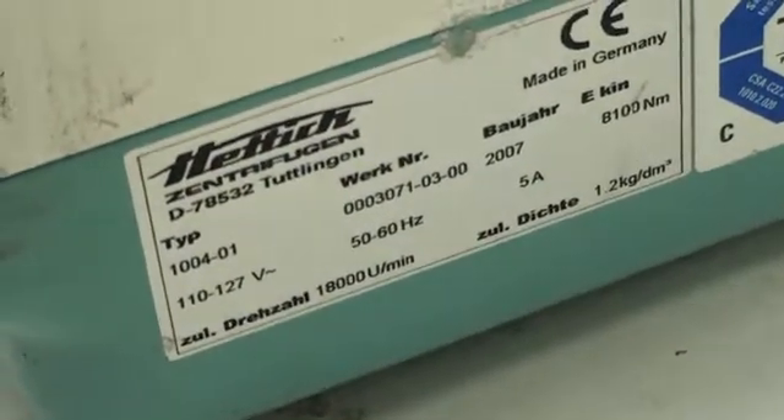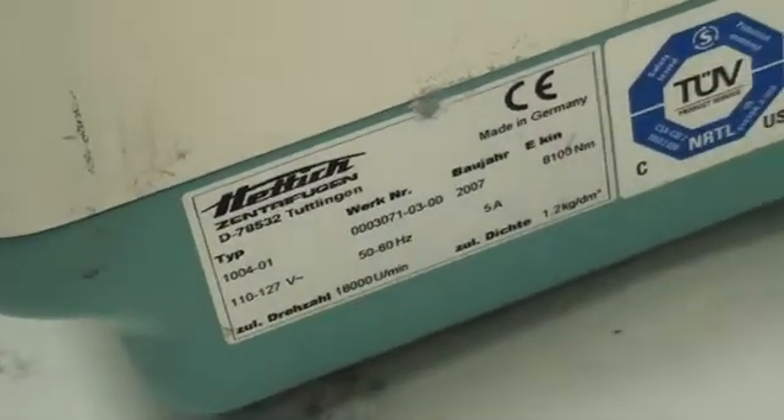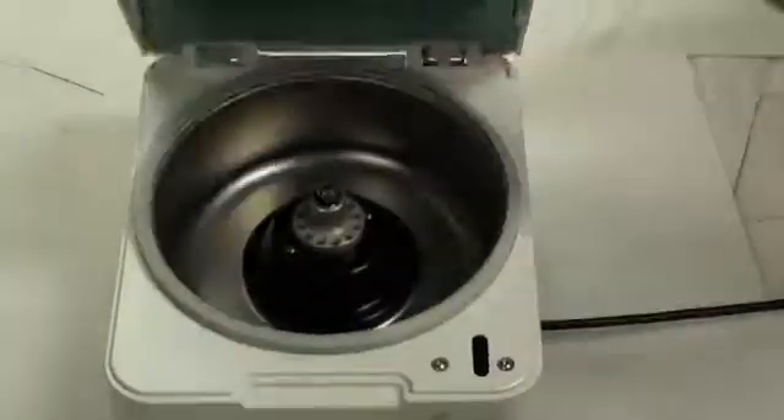Alright, so Eric's going to go ahead and show you guys the back plate. Here's more information with the work type, model numbers, tags and labels. As you saw, it did have quite a smooth run and stop. This machine is in great shape and we do also have two other copies of this model. If you guys have any other questions, you can let us know at MyCyberOfficeID on eBay or MyCyberOffice.com.